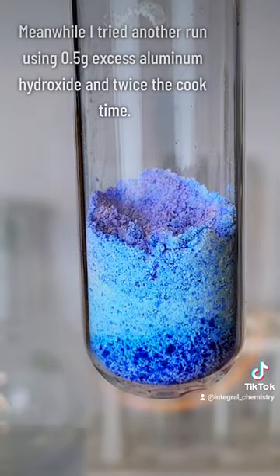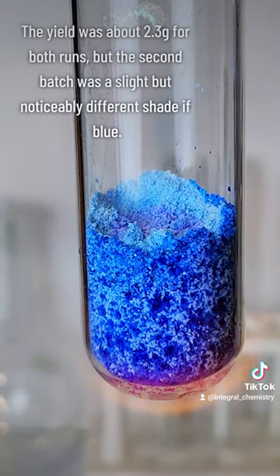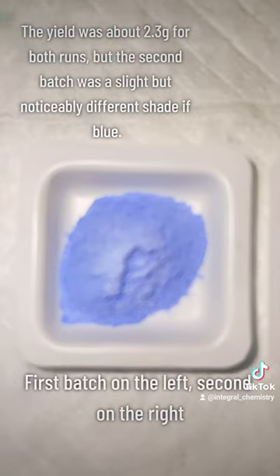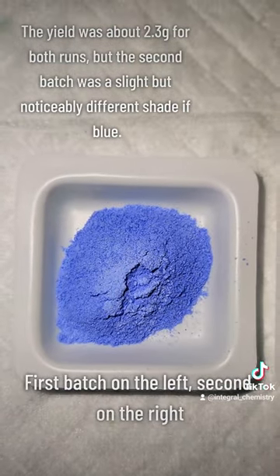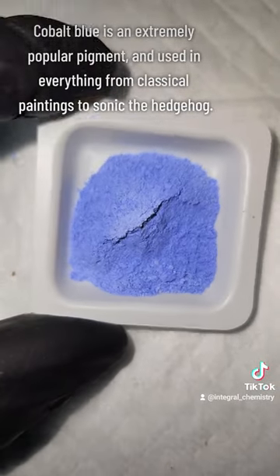Meanwhile, I tried another run using 0.5 grams excess aluminum hydroxide and twice the cook time to see if that made any difference in yield or color. The yield was almost identical in both runs at about 2.3 grams each, but the second batch was a noticeably darker shade of blue, and I found that interesting.